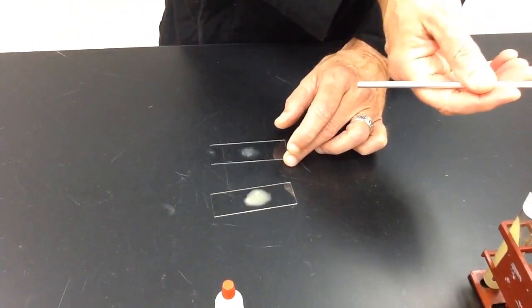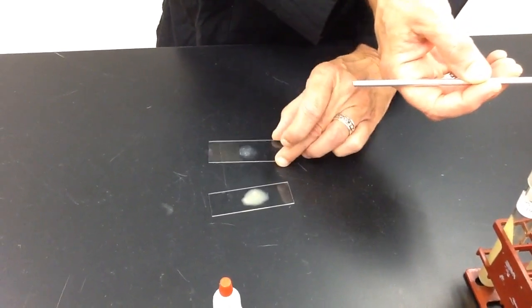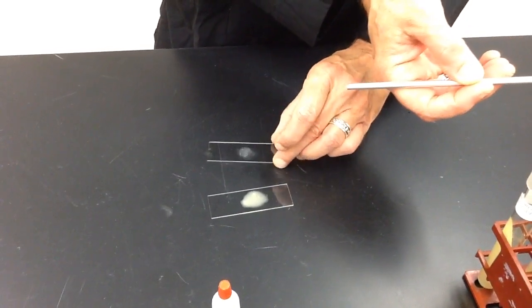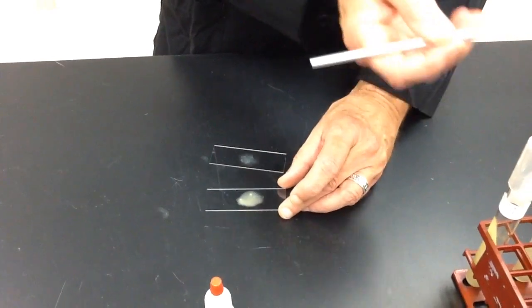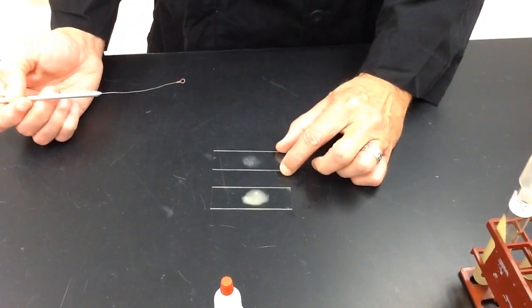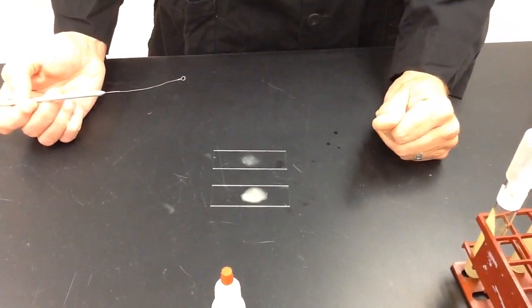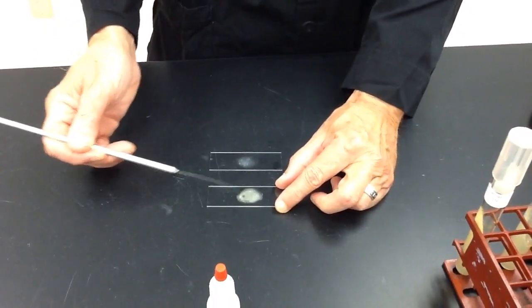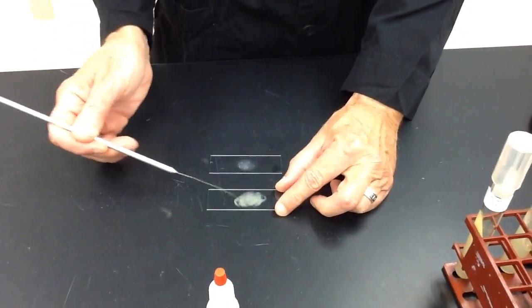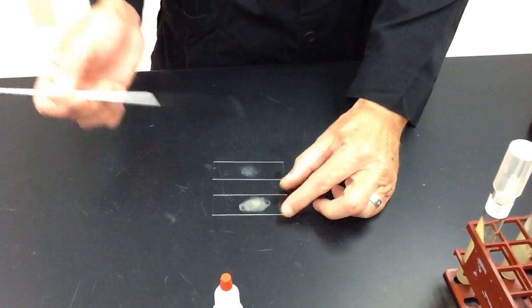And then let's just take a quick look again at the gram-positive. So even as you go this way, you see how that is kind of slimy. This one is watery. So think of it as it's like you're whipping up some eggs with that. And then this one just stays watery. It doesn't really follow around like the gram-negative did. Okay? And that's it for this experiment.